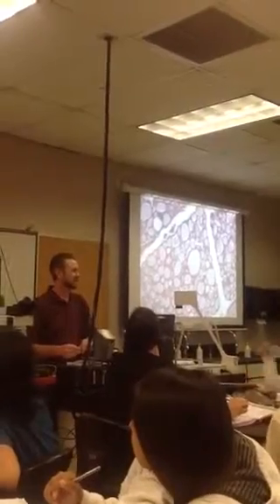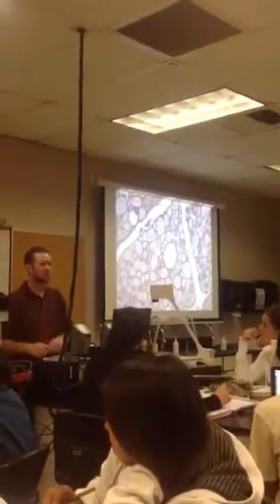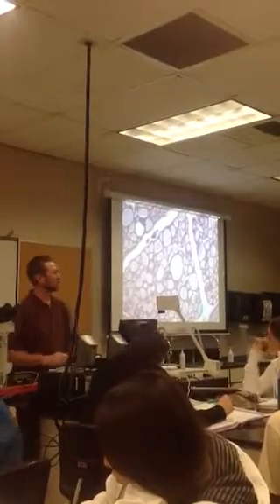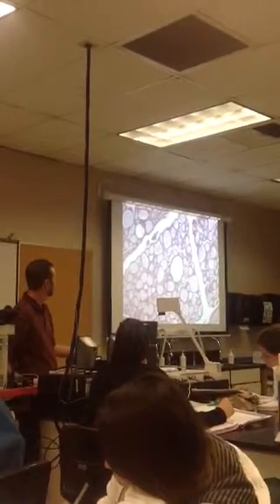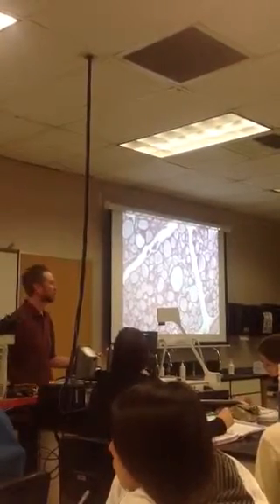So thyroid? The location is the thyroid gland. So this is the thyroid gland. Simple cuboidal epithelial tissue. Alright, well, on the thyroid, what you're seeing here, that simple cuboidal epithelial tissue, remember surrounding the follicles is your simple cuboidal? So each one of these circular oval structures are follicles, and they're surrounded by what are known as follicular cells.